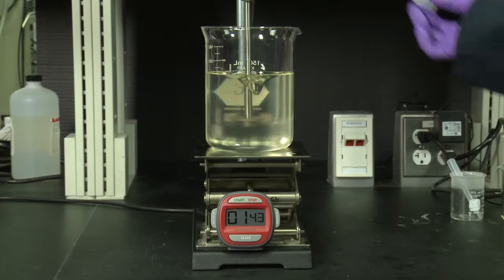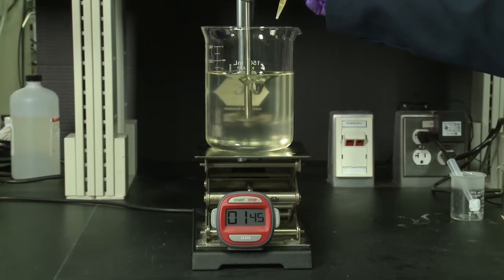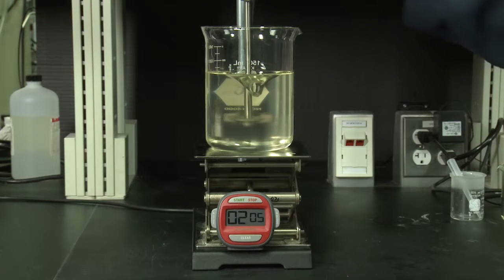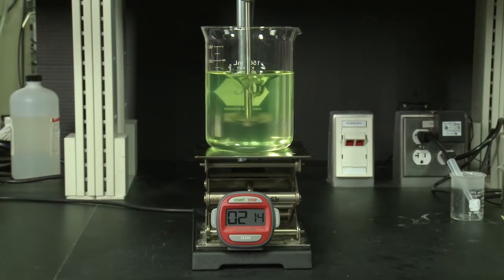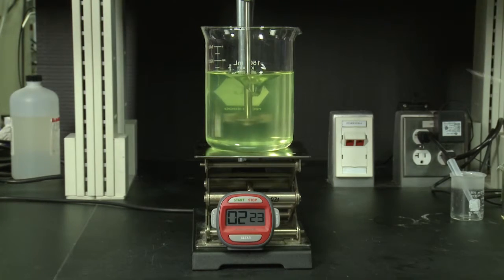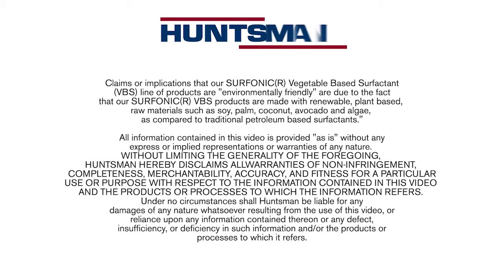Now we'll go ahead and add in a preservative. And then lastly, we'll add our dye and our fragrance. And now we have a liquid dish soap formulation using Sirphonic VBS C10.